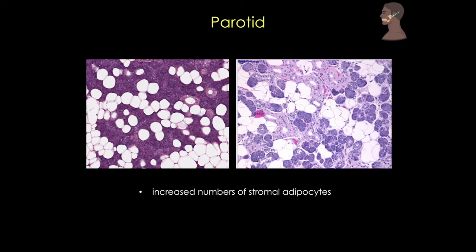The first and probably easiest feature to look for is fat, or adipocytes. The pancreas and parotid gland differ in the amount of stromal fat, with adipocytes much more common in the stroma of the parotid, but fairly rare in the pancreas.